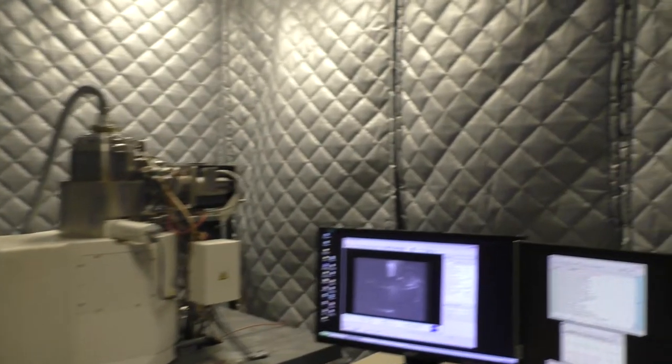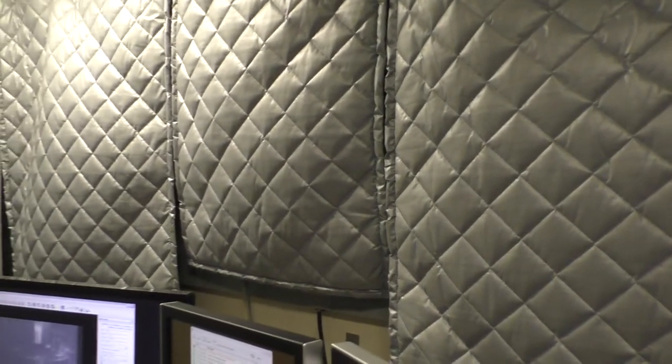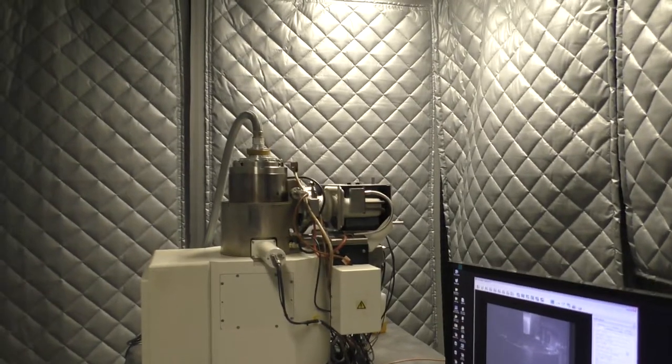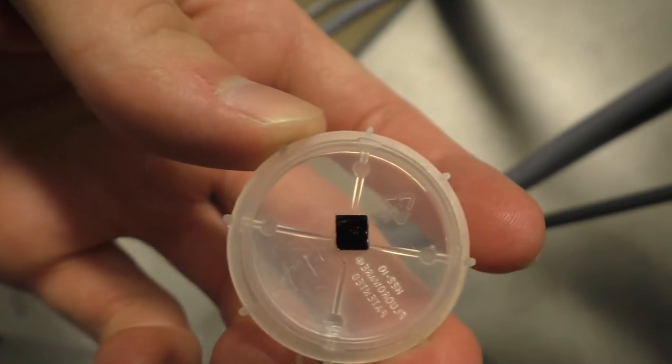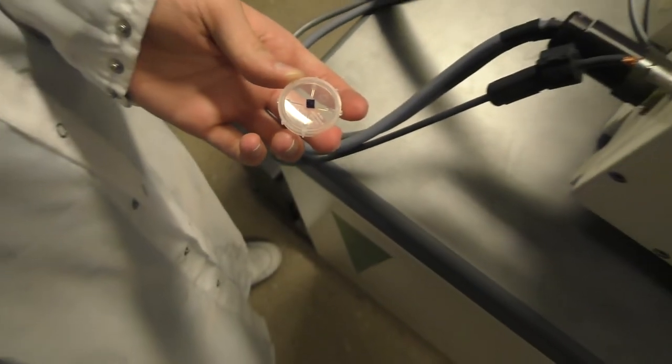How do we operate an electron microscope? Here's an example. Let's try to have a close view of a microdevice on the substrate. With our naked eyes, we obviously can't see anything.